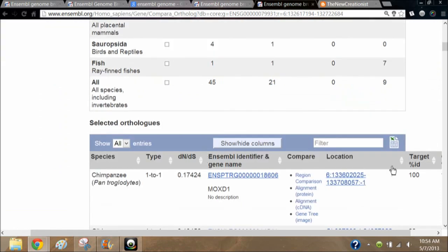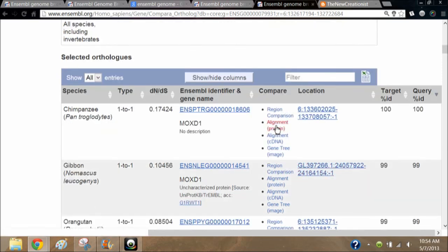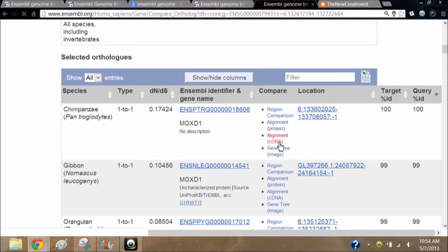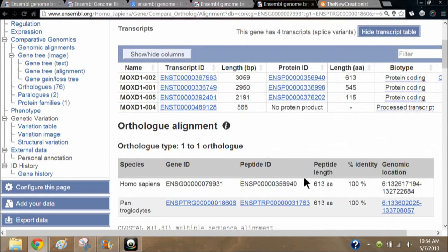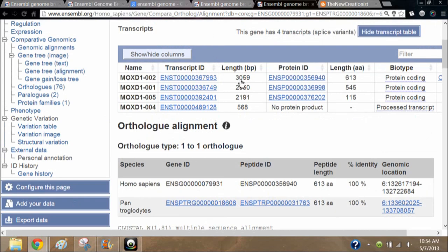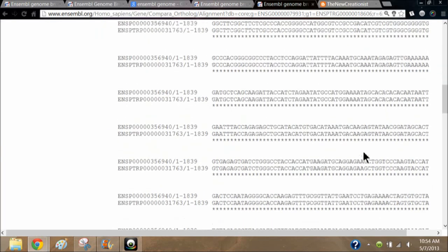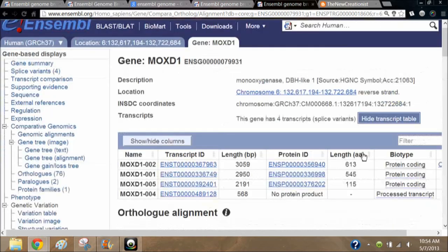Then go down, click query percent — chimpanzee 100% — and just go down and do your comparisons. Like we looked through the protein alignment for the first gene, you could also do the cDNA alignment, which in this case is a fairly long gene at nearly 3,000 base pairs, so you'll have a lot to look through. That's usually why I just look at the protein first.